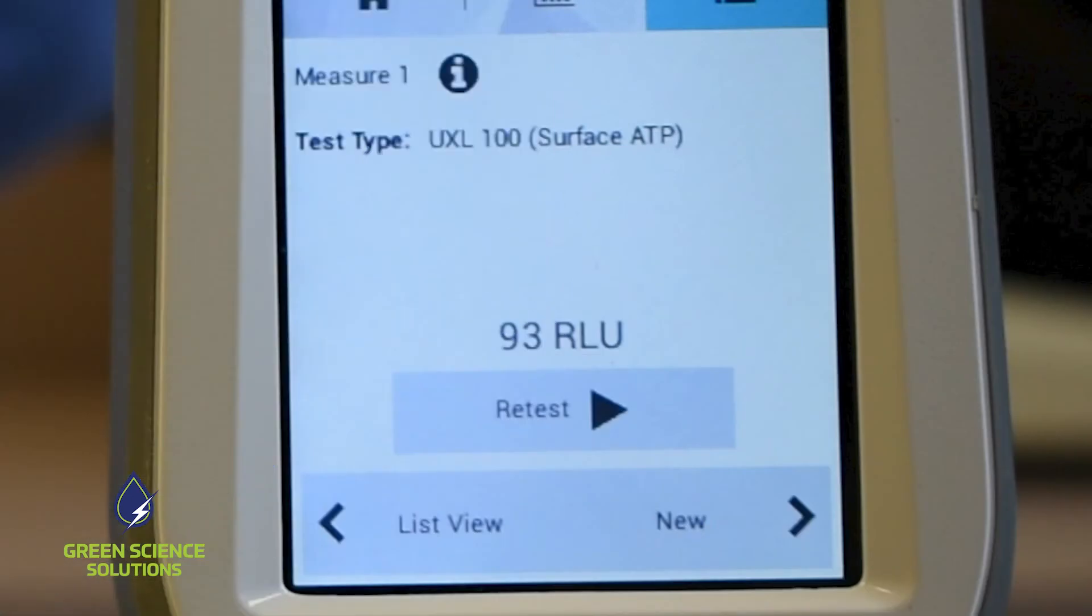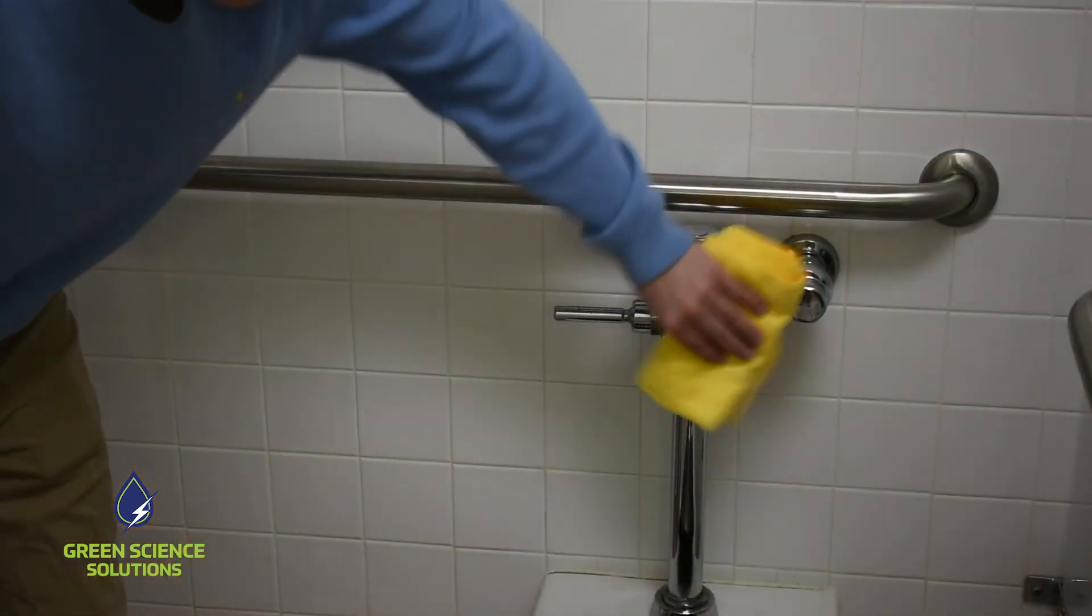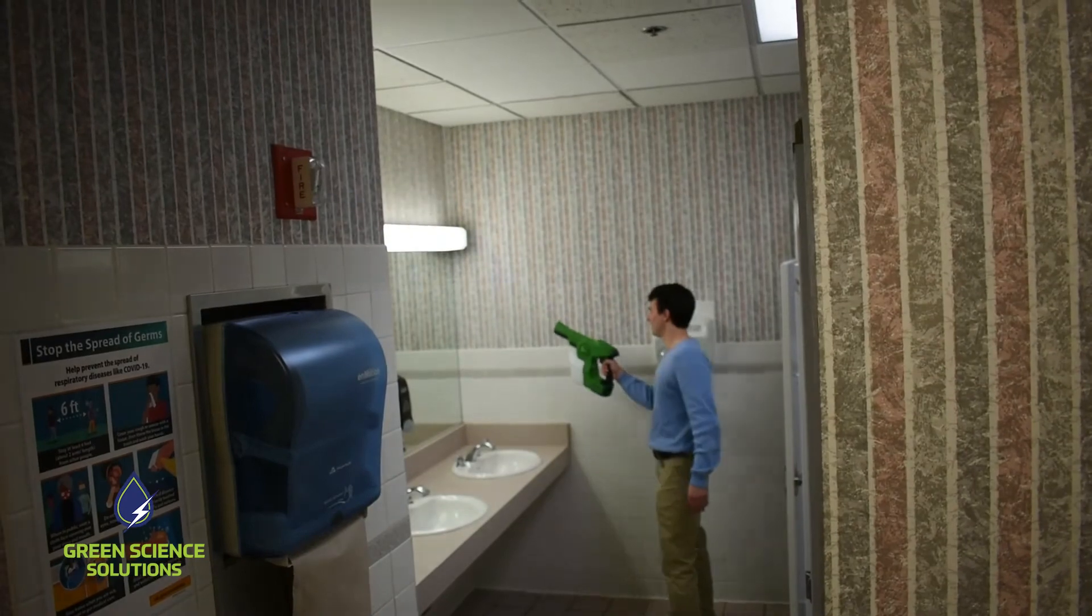You can see how effective the SAO water is after just one application. You can expect that number to go down even further with subsequent cleanings of SAO.